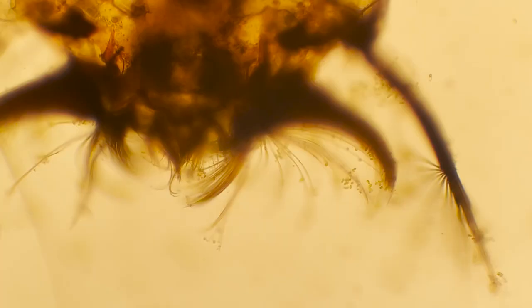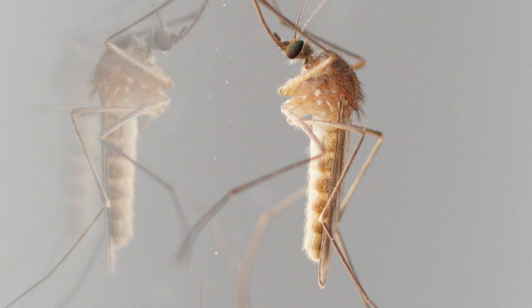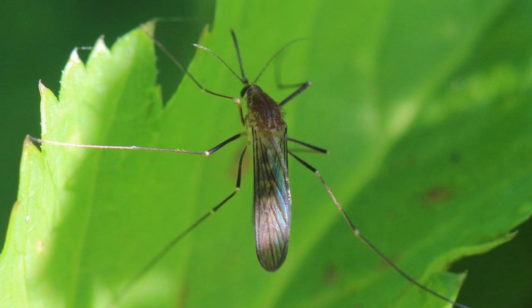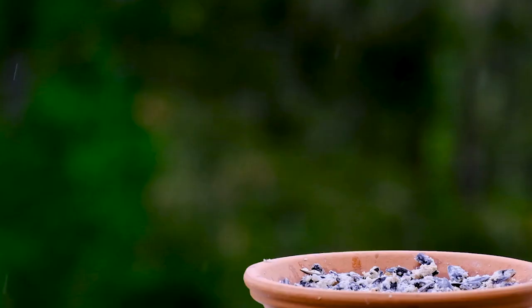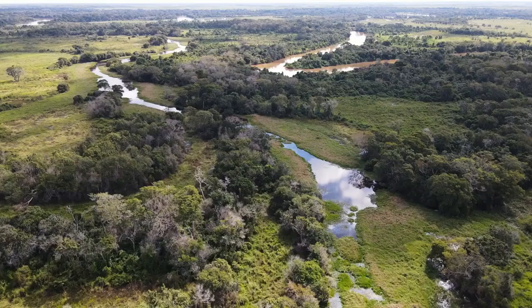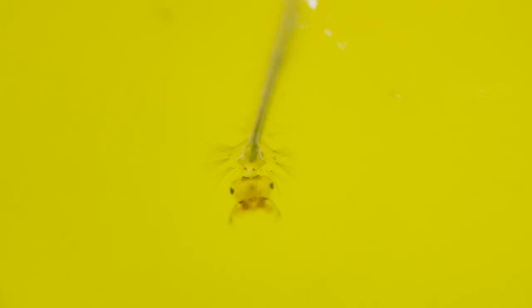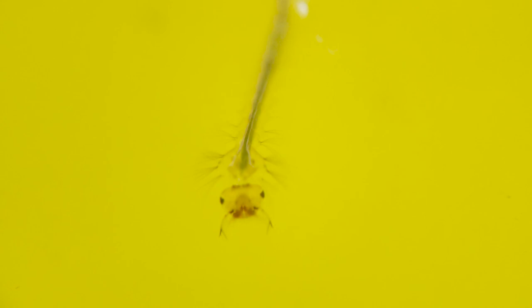But I think these guys belong to the genus Culex, and possibly the species Culex pipiens. Culex pipiens are the most common mosquito in the UK and are sometimes known as the common house mosquito. And while most people would prefer them not to be a common sight in the house, this species is actually more of a nuisance to birds than it is to humans, with the adults seldom travelling more than a few hundred metres from where the larvae developed. So the next time you spot a mozzie, spare a thought for the intricate larval lives it's lived, before you gently invite it to buzz off.